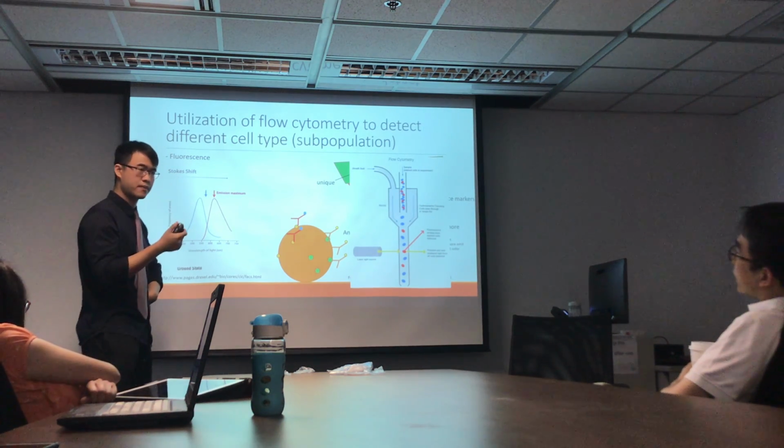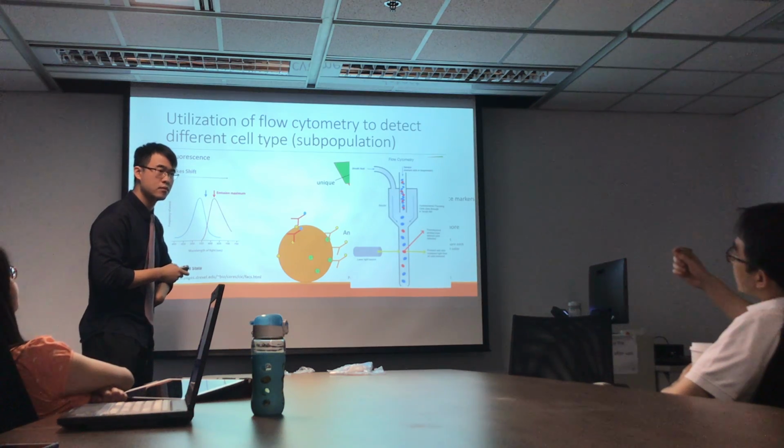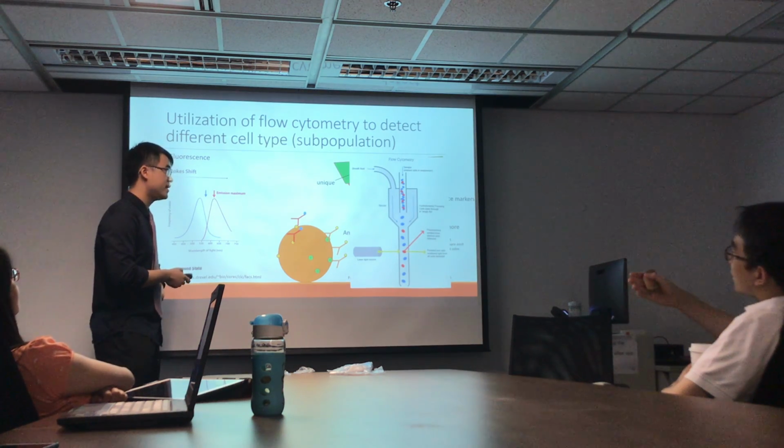Yes, it's on the fly. So if it's fluorescent, then we sort it somewhere. Yes, we do have that.